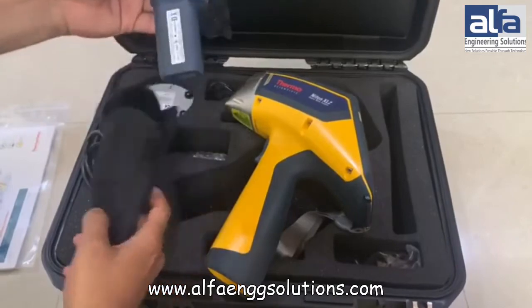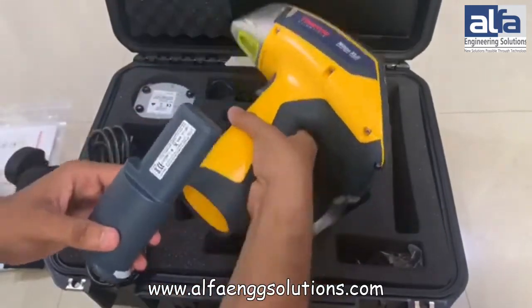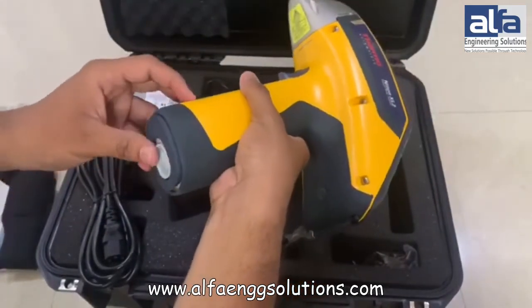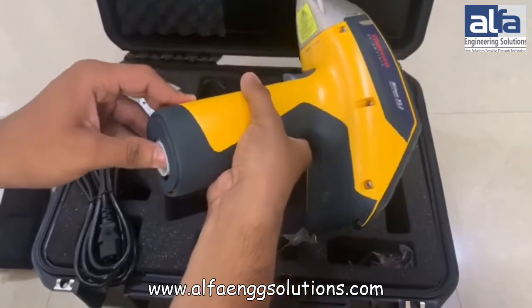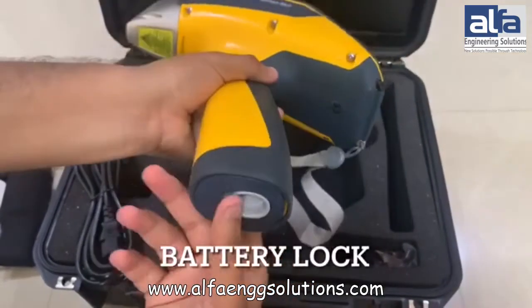I am going to show you how to connect the battery with the device. The battery has an auto lock feature which automatically gets locked when the battery is inserted into the device.